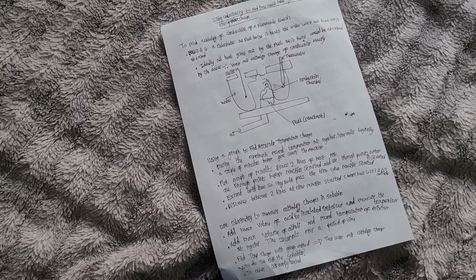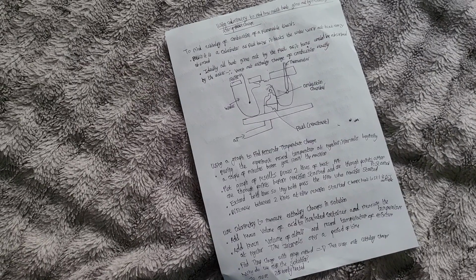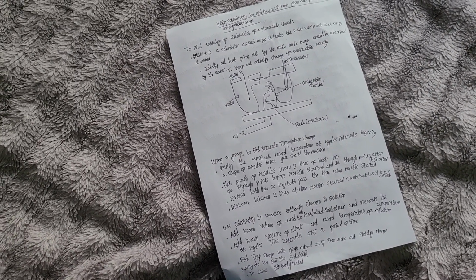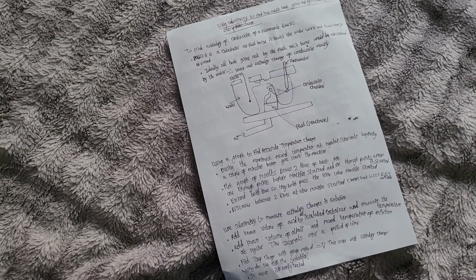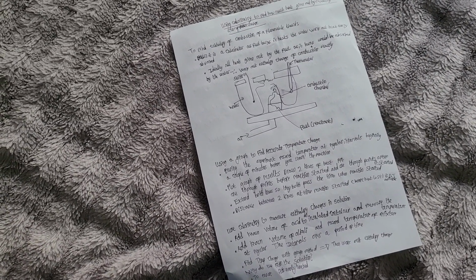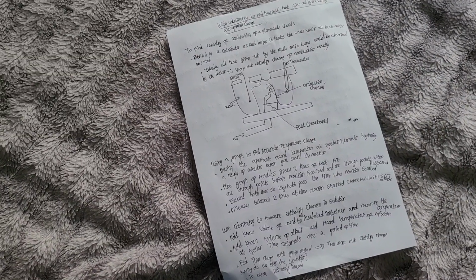Using calorimetry to measure enthalpy changes in solution. Add a known volume of acid to an insulated container and measure the temperature. Add a known volume of alkali and record the temperature of the mixture at regular time intervals over a period of time. Find the temperature change with the graph method, then work out the enthalpy change.